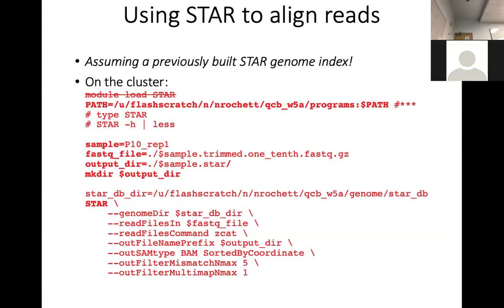But the thing is, you should just continue to manually trace it. Yeah, just always waiting.